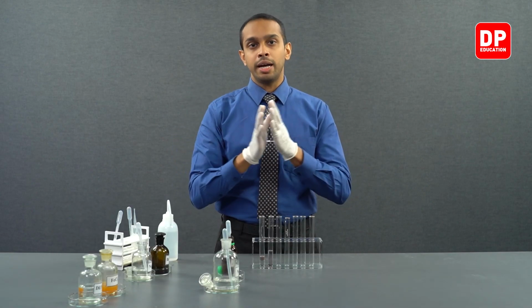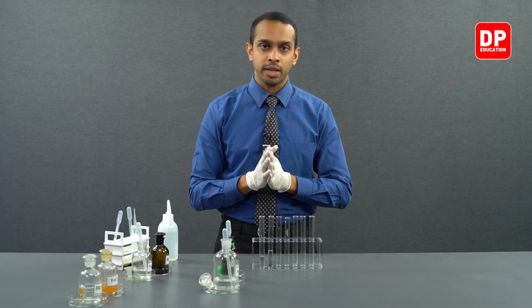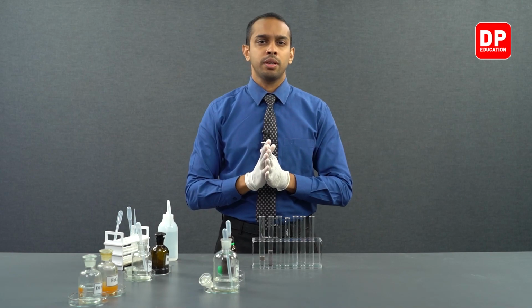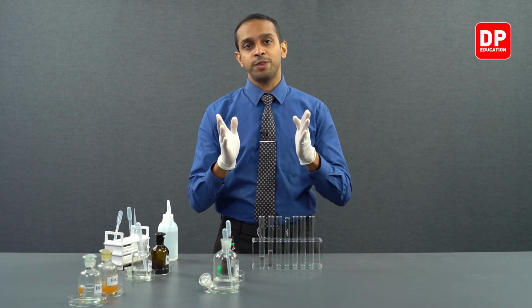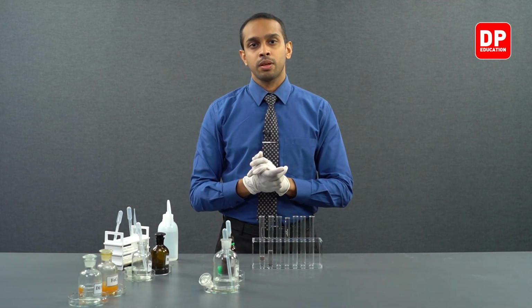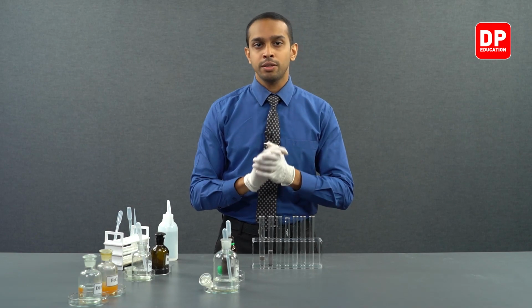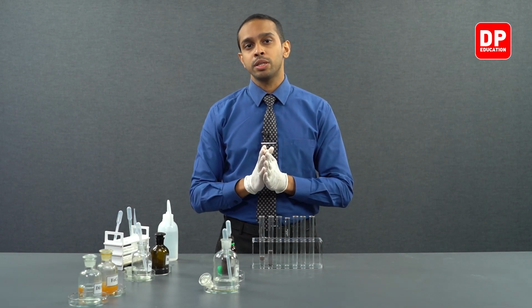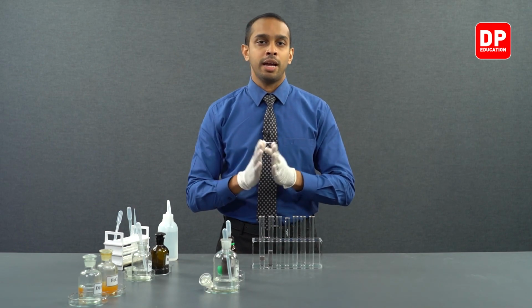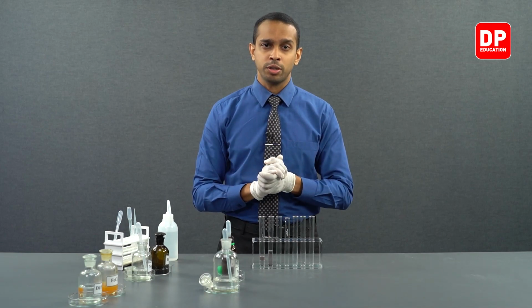Phenol is slightly acidic, so in the presence of sodium hydroxide, phenol reacts with sodium hydroxide and forms sodium phenoxide. The OH minus ions from sodium hydroxide react with the H plus that is released from phenol, and phenol produces phenoxide ions, and together with the sodium plus ions in the medium, they will form sodium phenoxide.